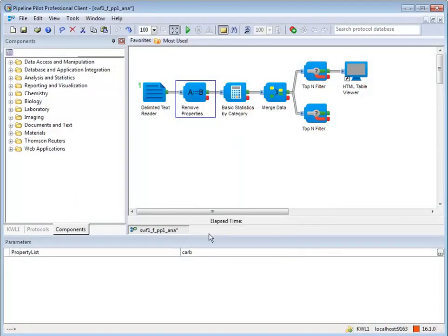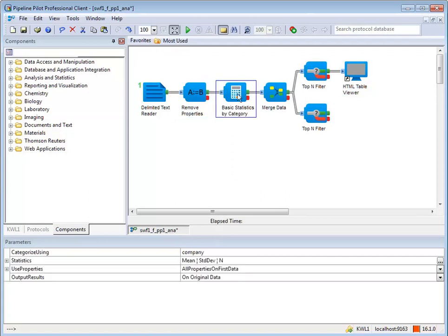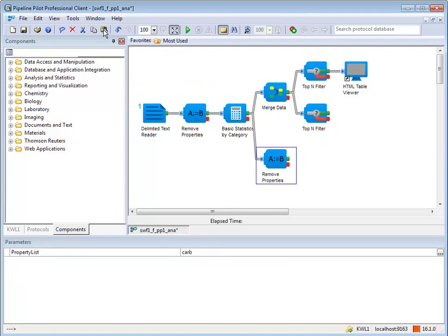Where the component will be pasted depends on what is selected in your protocol. If a component is selected, the pasted component will be branched off the selected component.